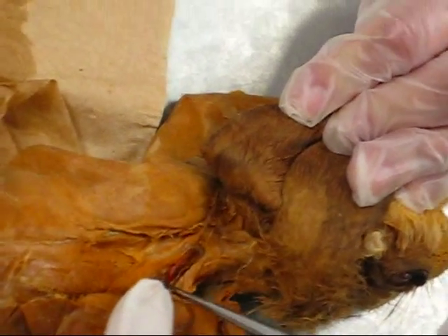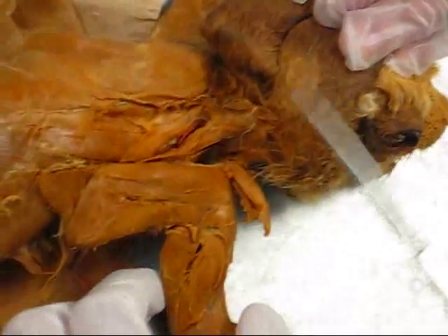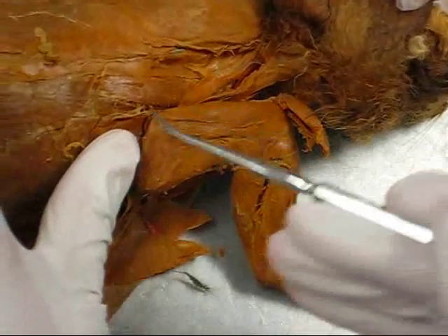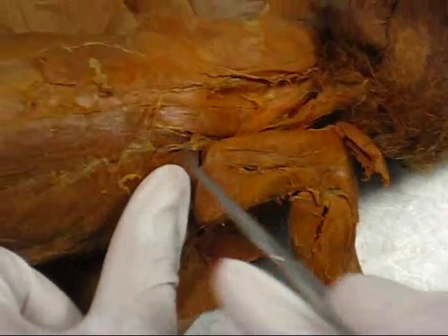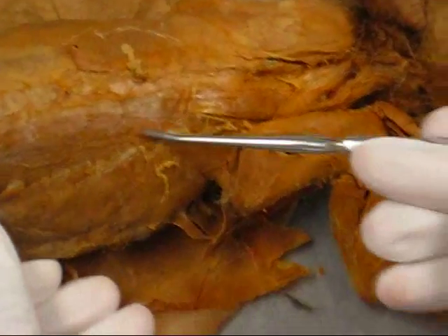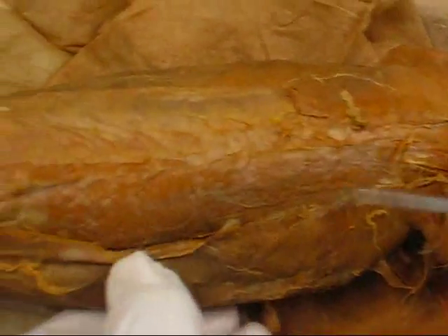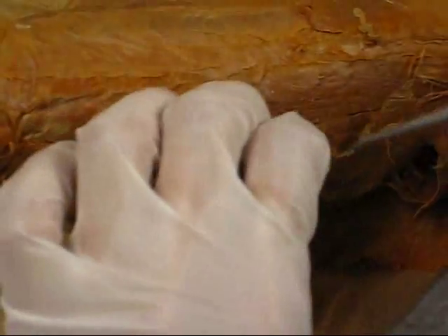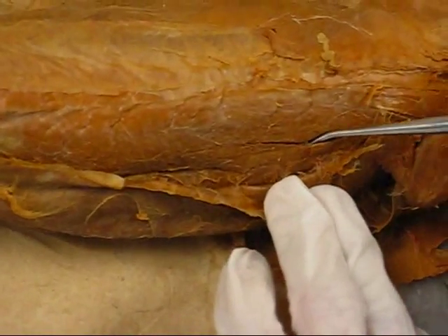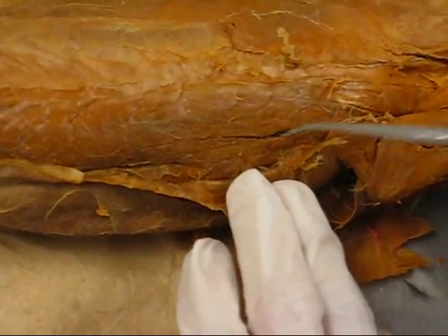And deep to that is the splenius. Spinalis dorsi. This is the iliocostalis — iliocostalis.